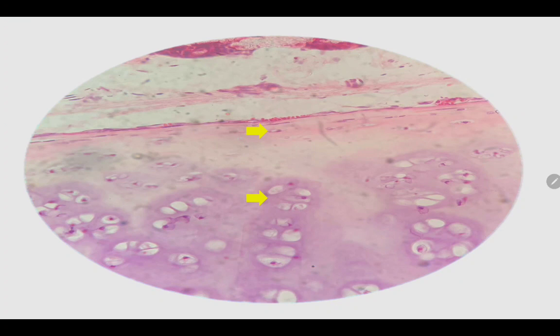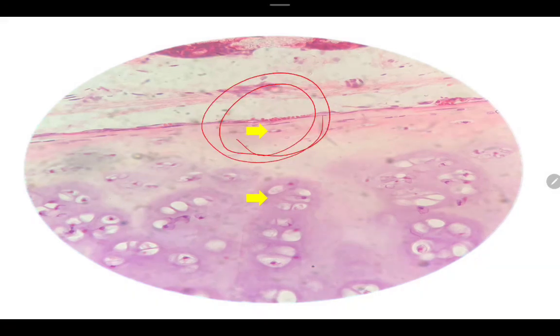Okay? The yellow arrow, this one, anong tawag dyan? Tama, chondroblast. Ito naman, yung second yellow arrow natin, ang tawag dyan is the isogenous aggregates, or isogenous cell group. Okay, very good. So, as you can see from here, pababa ganyan ang kanilang mature formation. Kapag itong 8 to 10 chondrocytes natin, ready na sila mag-settle down, they will really move apart and occupy their individual lacuna, to which do na sila magstay.